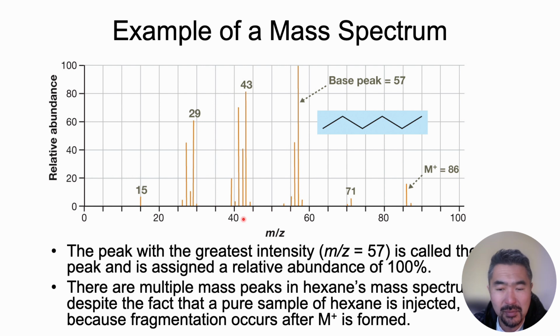Because technically, if the ion has two charges on it, the detected mass will be half of that, and hence it's mass over charge. But typically, we're only looking at a single charged ion, so you don't have to worry about the fact that charge might be 2 or 3. That becomes important for really big molecules like proteins, but you could assume that these are just single charged ions, at least for a class. And so this is the molar mass.